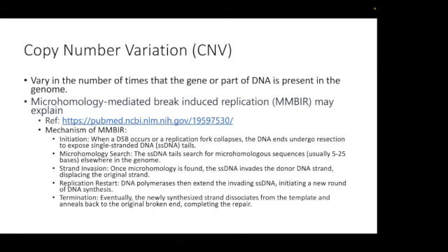If there is a copy number variation in a certain region, it's like that. So for the tiling array, you basically make tiles, and the tiles are prefabricated, and if you see higher intensity, that region has more copies. In NGS, you just align it and then check out the histogram.